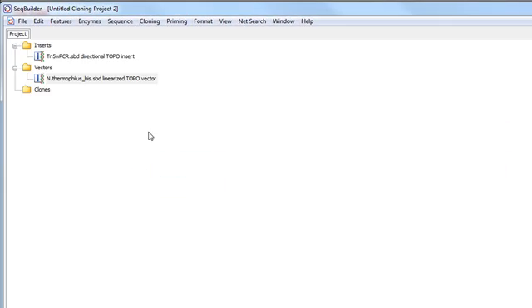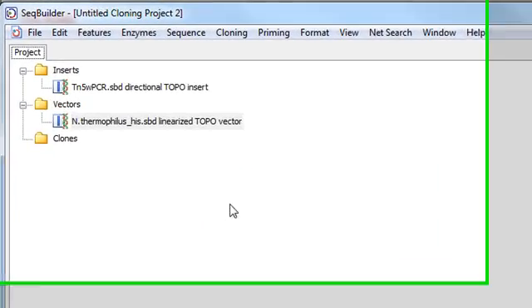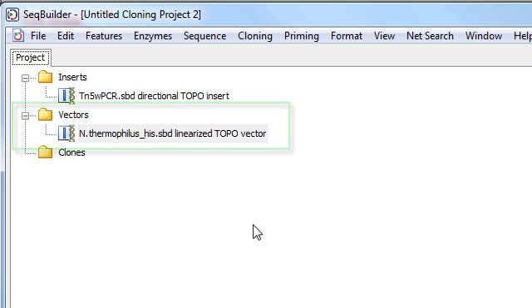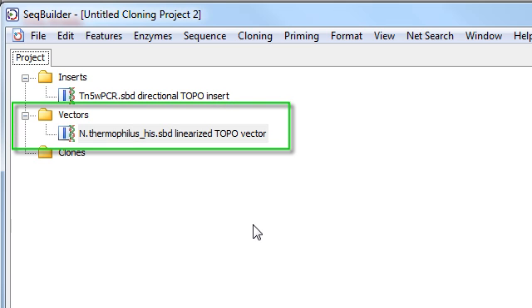And what that will actually do while you're holding down the shortcut key is to use your selected sequence to create a linearized TOPO vector with the appropriate 5' overhang and 3' end, and it will put it in your vectors folder for your project.